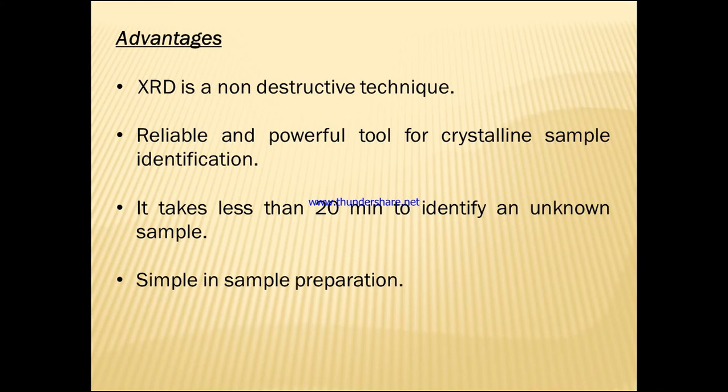Based on that, we can identify crystalline materials. It takes less than 20 minutes to identify an unknown sample here, and sample preparation is simple. Sample preparation can be made by using different techniques.